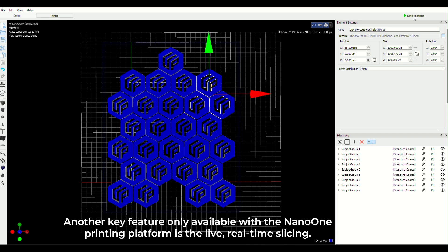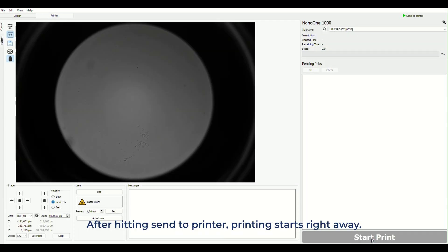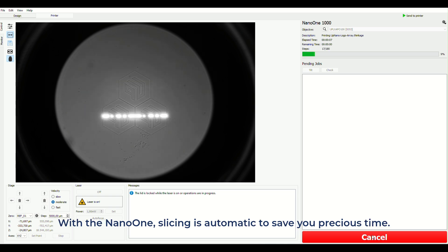Another key feature only available with the Nano One printing platform is the live, real-time slicing. After hitting send to printer, printing starts right away. With the Nano One, slicing is automatic to save you precious time.